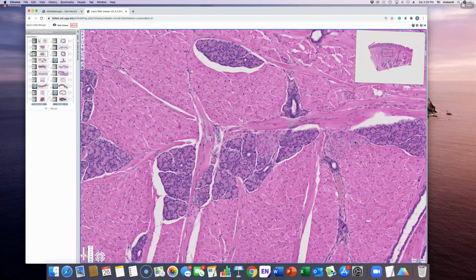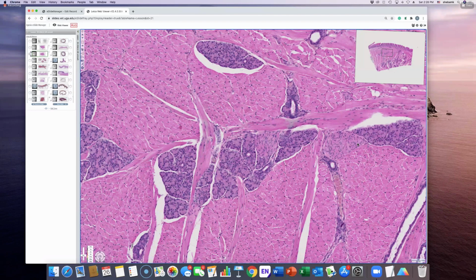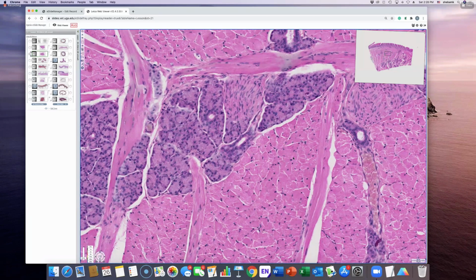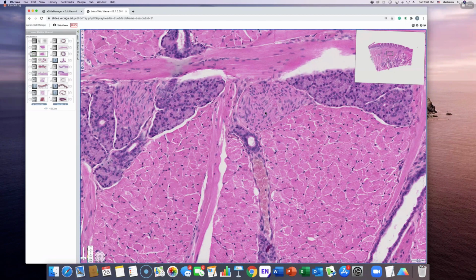This would be skeletal muscle? Think again. There is skeletal muscle in this picture. This is skeletal muscle. Are those axons then? Yes, of the taste receptor cells? I don't know. They could be, but in general, what would you call this bundle?